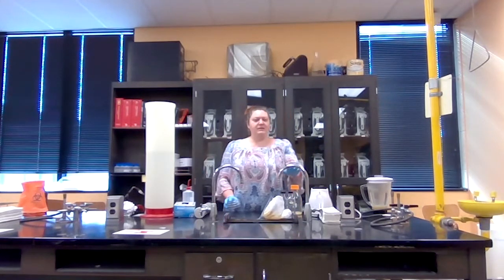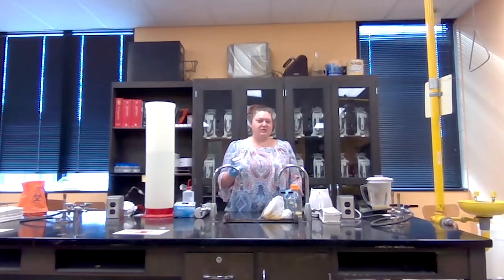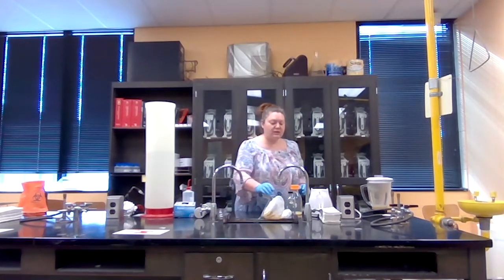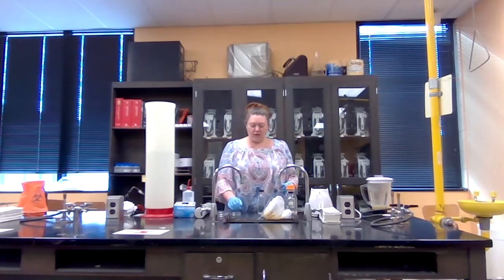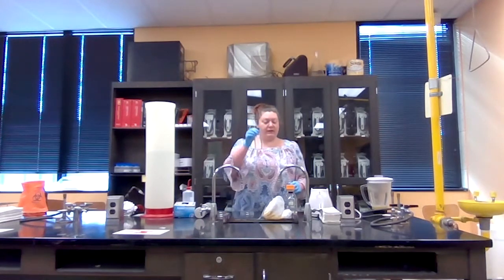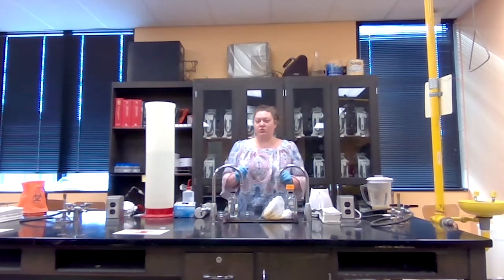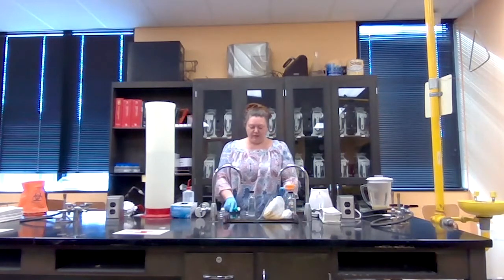Okay, the next step is putting some of this into the petri dishes. But we have to make some more dilutions of this first. So one thing that we are going to do is dilute this dilution another tenfold. So by doing that, we're going to dilute that 100-fold by putting it into here. We will be making a 10-fold dilution, but we don't need to do that by using water. And I'll show you that and show you why in just a moment. So I'm going to go ahead and make the 100-fold dilution into this container right here. So I'm going to do that.